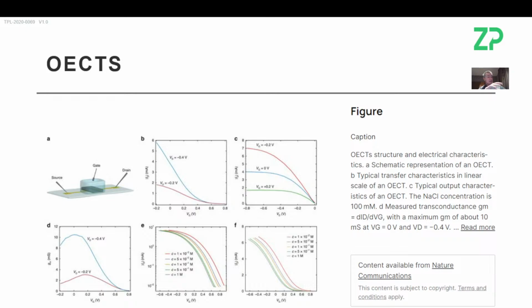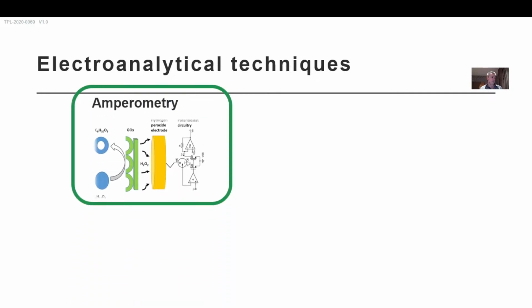We're actually all playing in the same realm. We're calling it different things, but I can understand these kinds of graphs because one of them looks like voltammetry and the other looks like amperometry to me. If people are interested in diving into that a little deeper, I'll be happy to do it. But with 14 questions today, I have to skip forward.